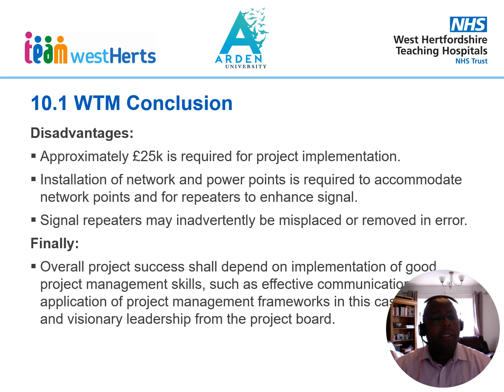Finally, this project will depend on implementation of good project management skills, such as effective communication, application of good project management frameworks such as Scrum, and also visionary leadership from the project board. So in all, I believe this is a good project that will meet trust strategic objectives and enable service user needs to be fully met, and for the department to be ISO 15189:2012 compliant.